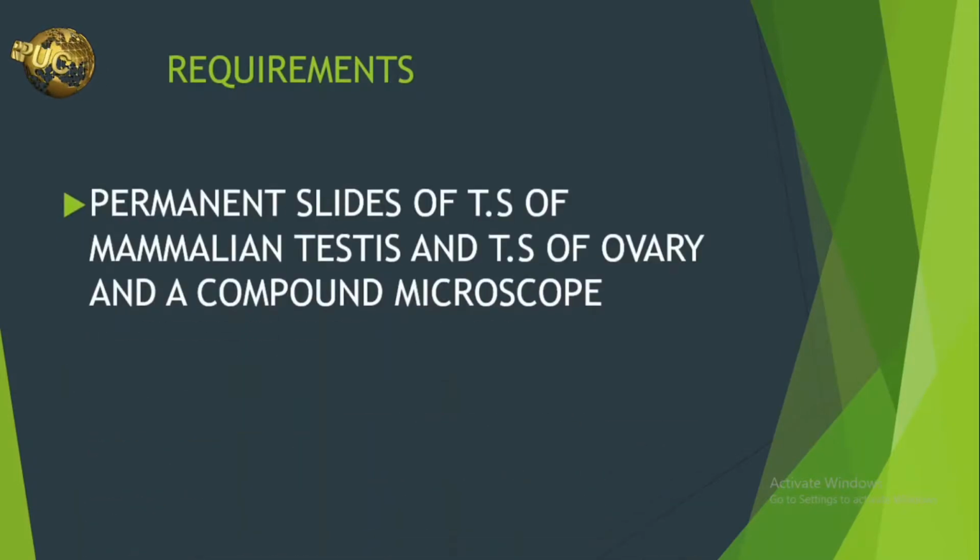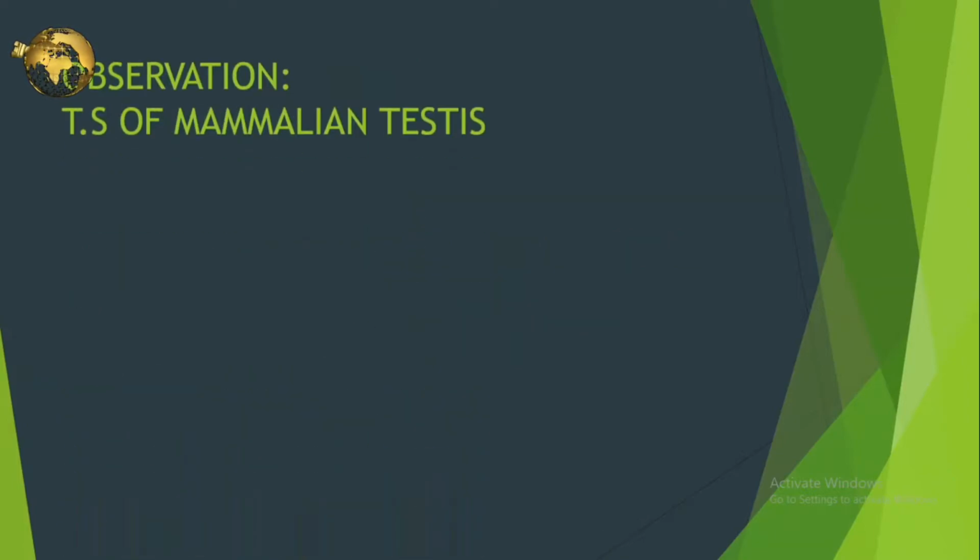Requirements: permanent slides of TS of mammalian testis and TS of ovary, and a compound microscope. Observation: TS of mammalian testis.